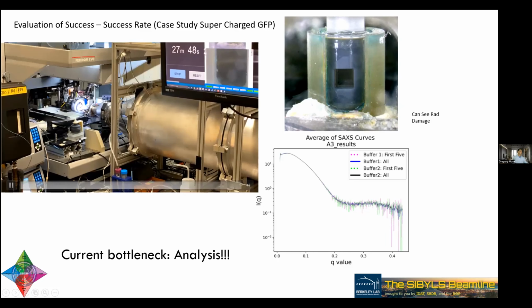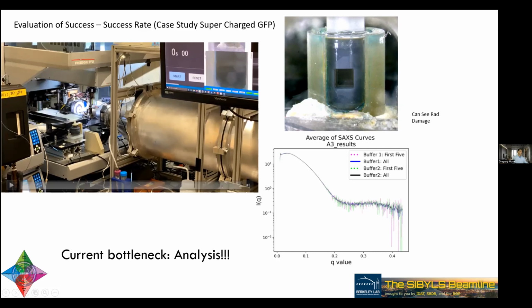There are steps in here for washing. So there's this ethanol bath and a hair dryer. It sucks up some ethanol between samples. Here's the sample being loaded in the sample position.